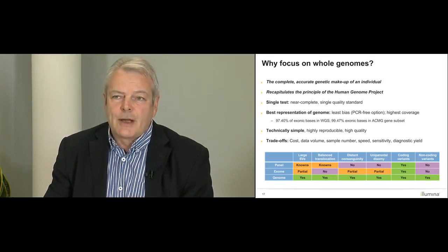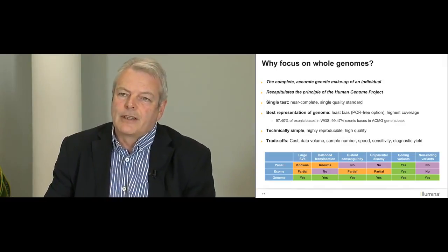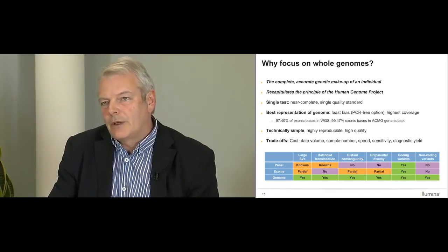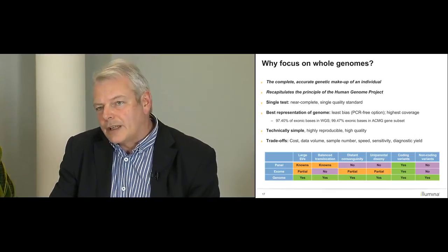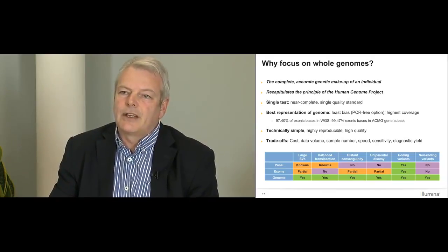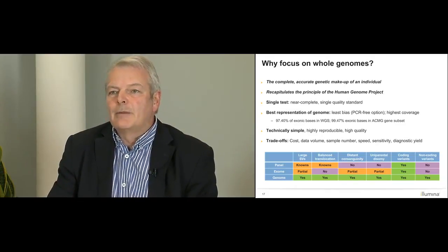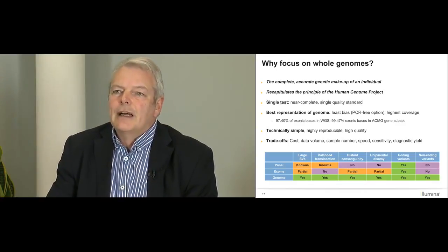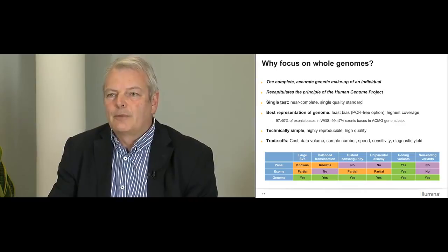It's also technically simple, a point which is perhaps not necessarily widely grasped as yet. It's a highly reproducible, high-quality product. I've illustrated the trade-offs there, though, of course. There is a question of cost, data volume to be handled, and I'll touch on that in a moment, and the number of samples that can be processed either in a time or in a particular capacity in terms of what is the appropriate way.